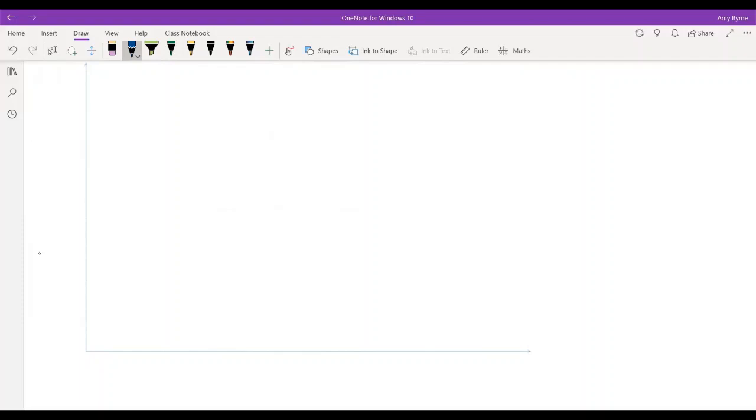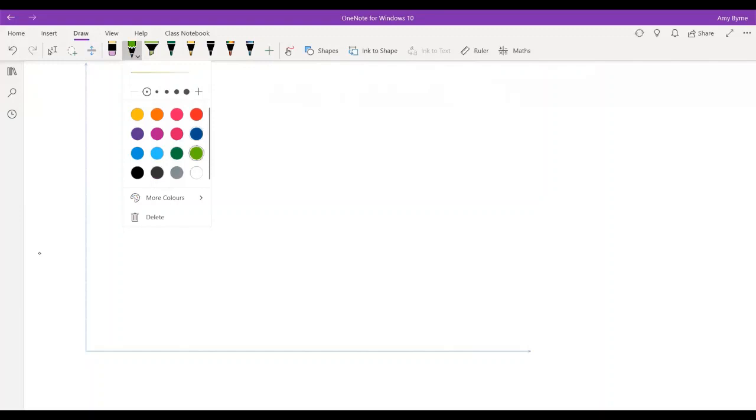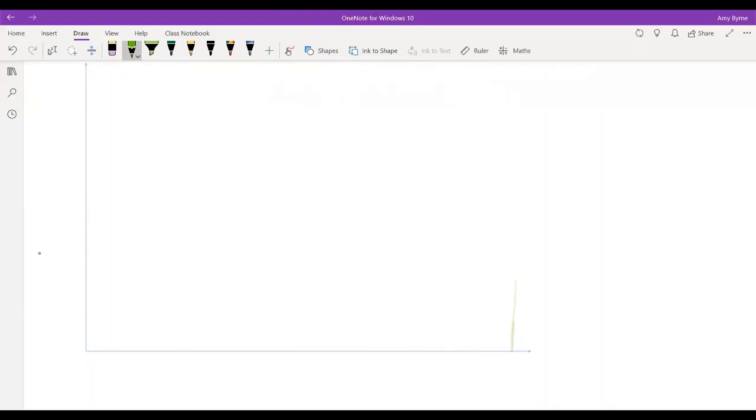The one that is most useful for us, I am going to see a rightmost peak up here at an M to Z of 46. That is my molecular ion.